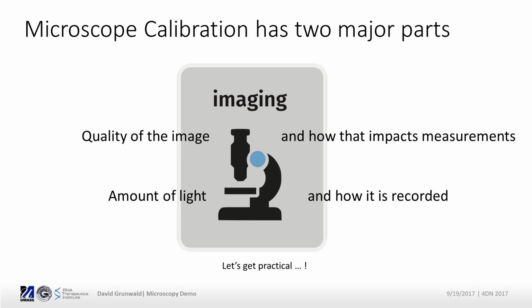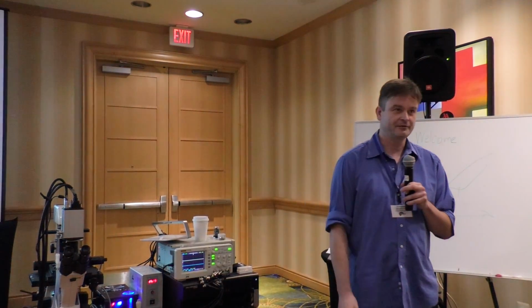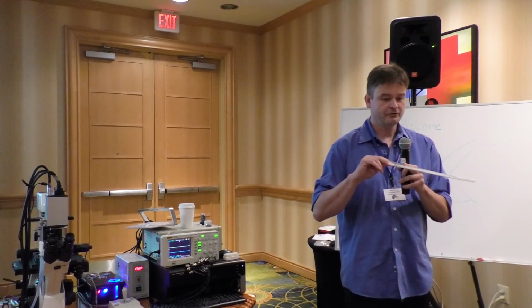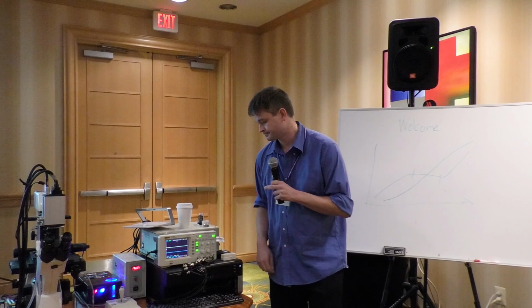So what is it we're looking for? What is there to a microscope? Well, in the end, the hope is that my little pipette here and that machine have something in common. For this guy, I have a clear expectation of precision, right? Half a unit of a scale. That should be my error. Something like that should exist for my microscope.